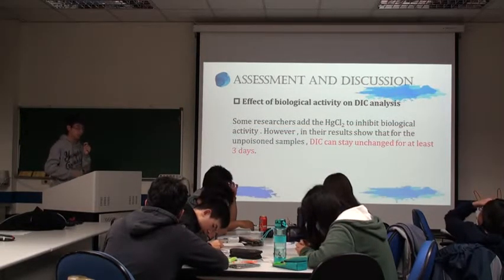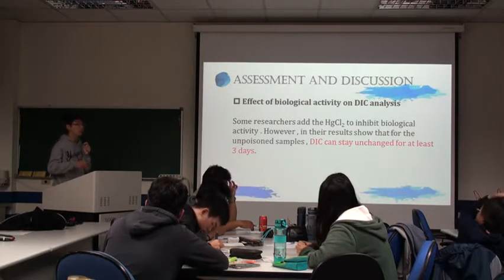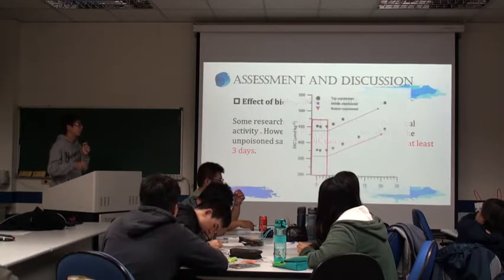Effect of biological activity on DIC measurement. Some researchers added HgCl2 to inhibit biological activity. However, their research shows that for the unpoisoned sample, DIC can stay unchanged for at least 3 days.